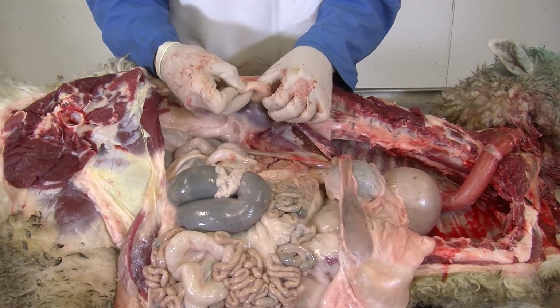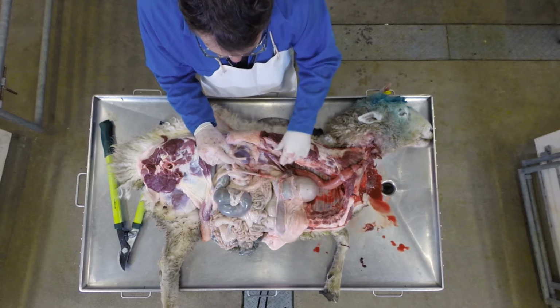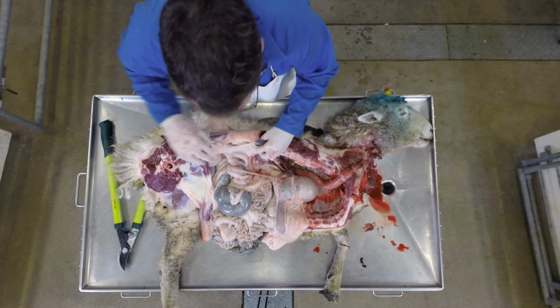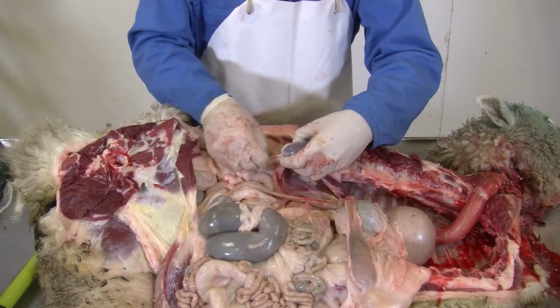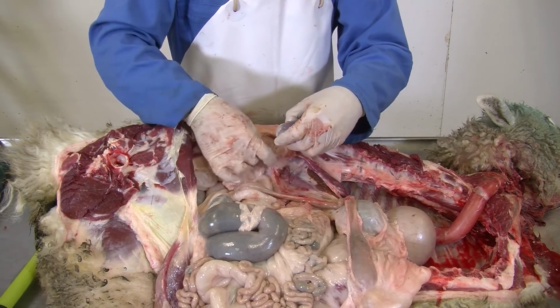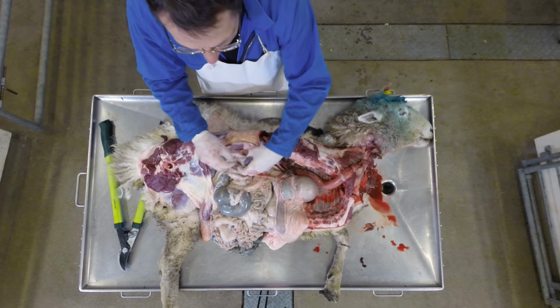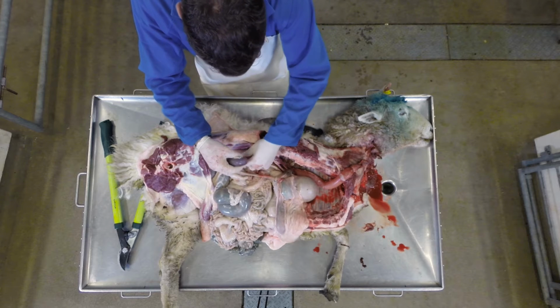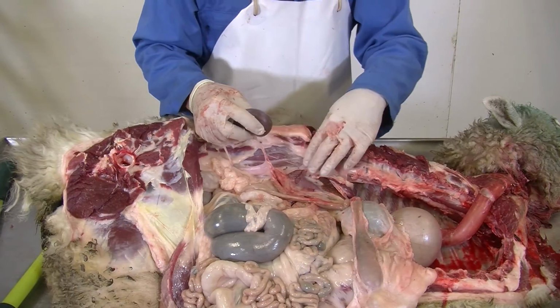Kidney often surrounded by a thick layer of fat, and there's a bit here with this animal, not that much, so we'll just pull away the fat, and so kidney is the organ that filters the blood and removes the waste products, and they are passed out in the urine.